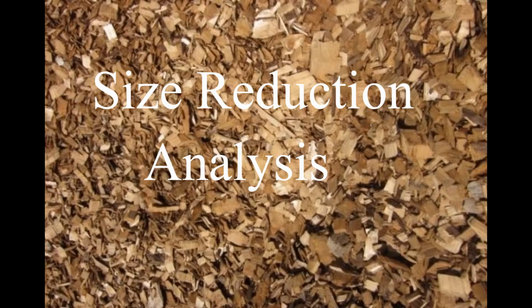This video will outline materials required and procedure to be followed when conducting a size reduction analysis. First, let's start with some background.